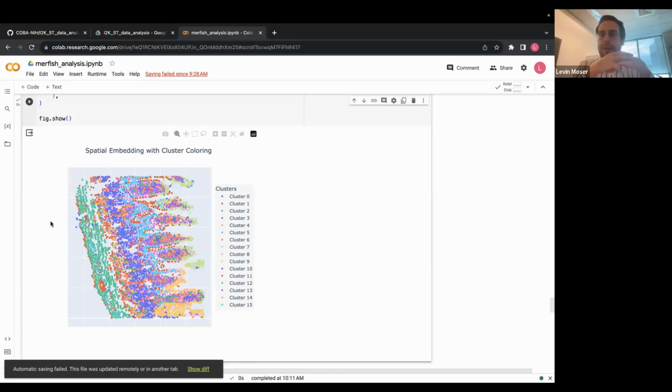And so apart from plotting a pretty image of it, what makes that interesting is that we can go a step further, and we can ask the question: we have these clusters here, we have a cluster here, we have this cluster, etc. They're spatially resolved. They probably represent some sort of cell types. Now, can we map a cluster to a cell type that is actually known in biology?